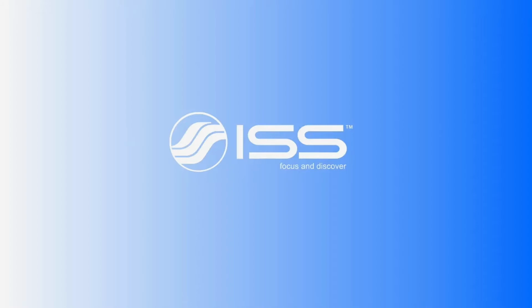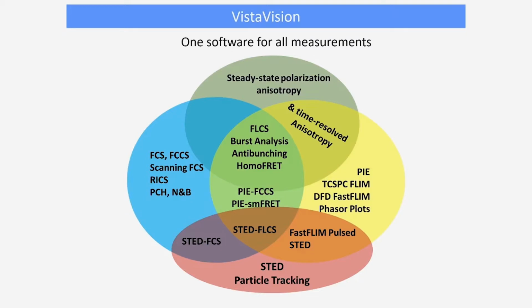Hello and welcome to another ISS video tutorial. We are going to take a brief look at phasor plots and go over different lifetime comparison tools the phasor plot offers on ISS VistaVision.